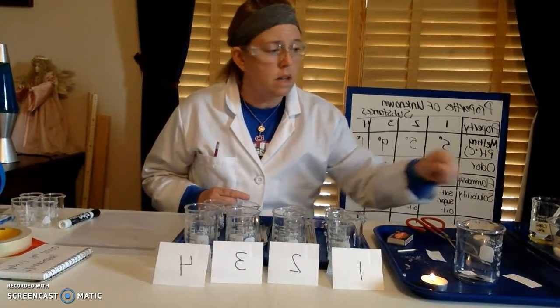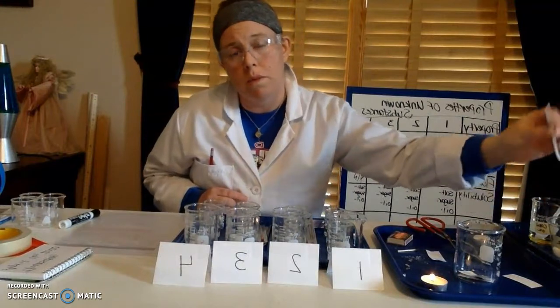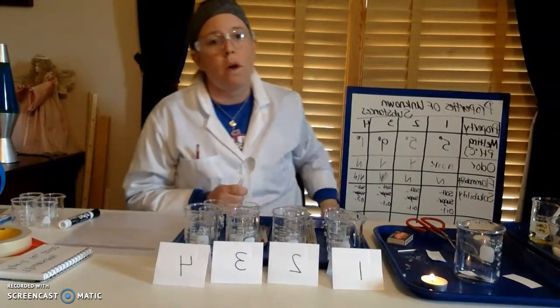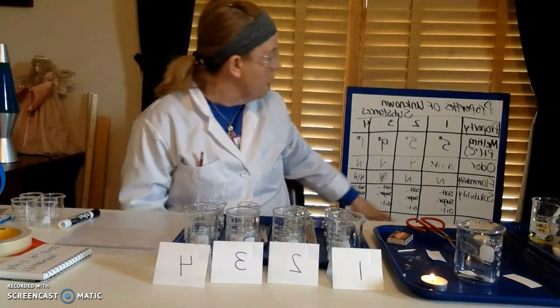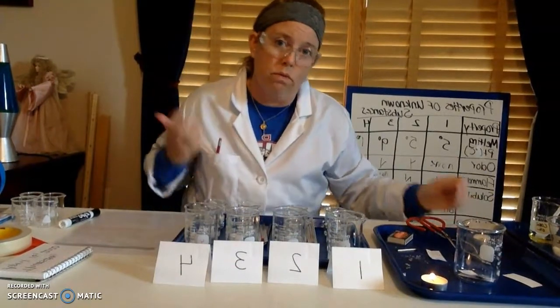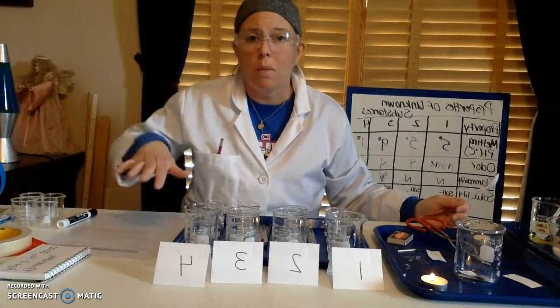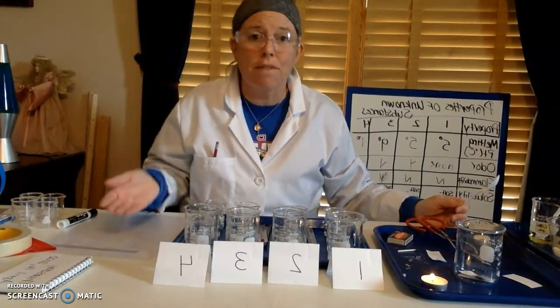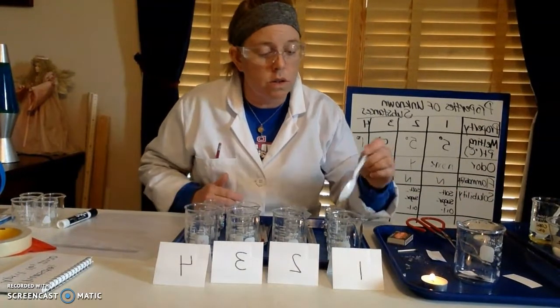All right, so the next thing that I'm going to do is check for solubility, and you're going to get a better visual of what those 3 substances are in the handout that I shared in Google Classroom. So we have salt, sugar, and corn oil. Obviously, it's made from corn, a vegetable oil. Safflower oil is another type of oil that's made from safflower seeds, so they're different.